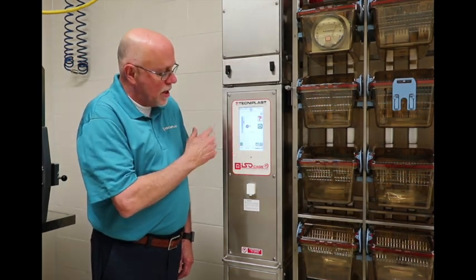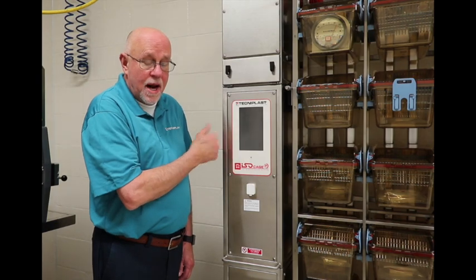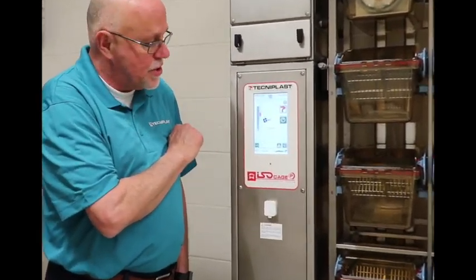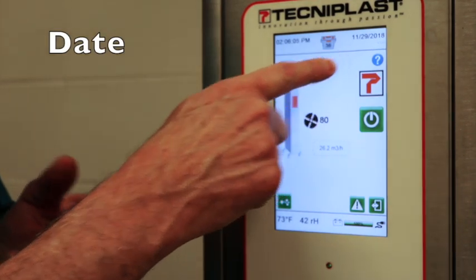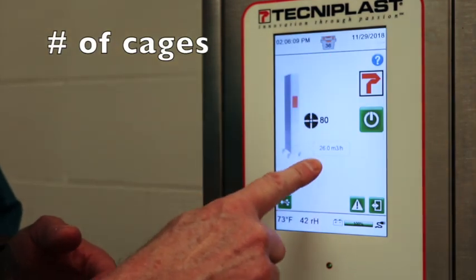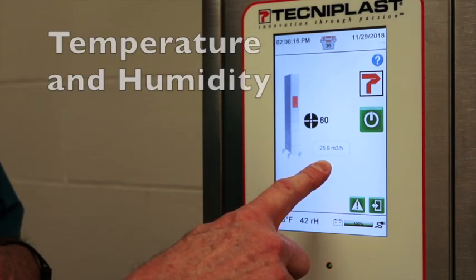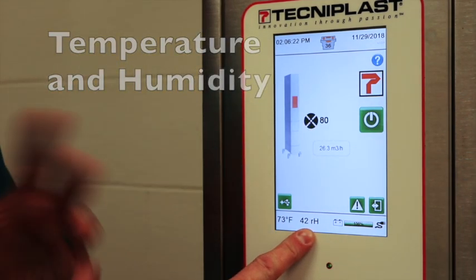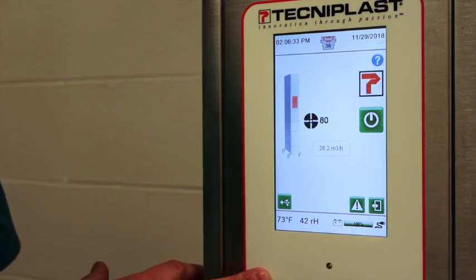We're now going to go over the touch screen. Initially when you walk into the room, the screen will be black so that the light does not disturb the animals at night. To get the screen to come back on, you just touch the screen. The screen shows the time and date in the middle, the number of cages — 36 — running at 80 pascals of pressure, and the resulting air changes per hour. It also shows temperature and humidity taken from the exhaust, which is not a reporting mechanism, and the battery life showing 100%. The unit should always be plugged in to maintain that 100%.